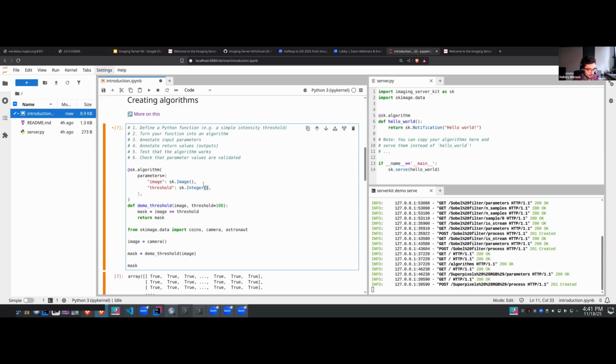And so then these classes here, you can initialize them with a set of parameters. So you can add, for example, a name. I will call this threshold. And for the integer type, you can add a minimum value of 0. In this case, a maximum value, I will set it to 255. Maybe a default value. Okay, and I can remove it from here.